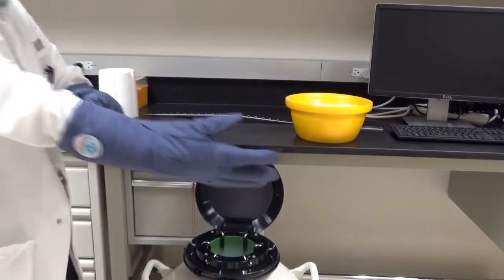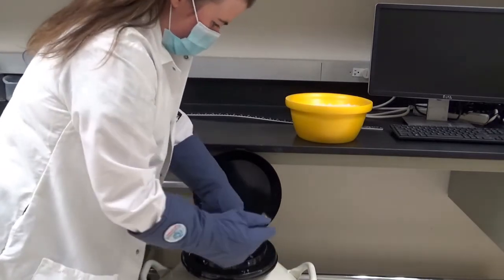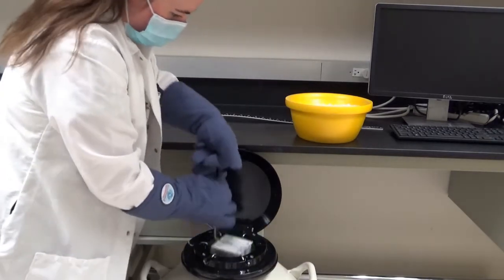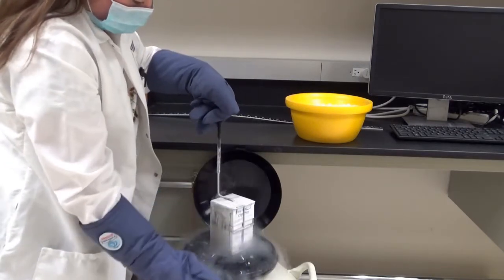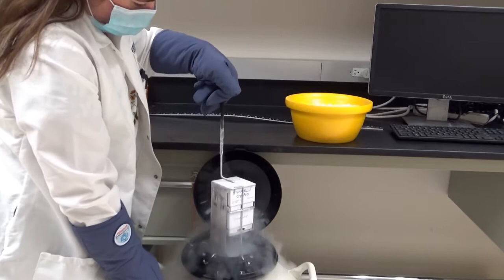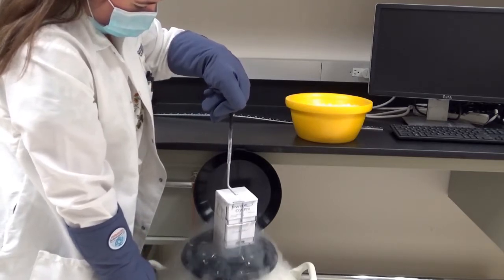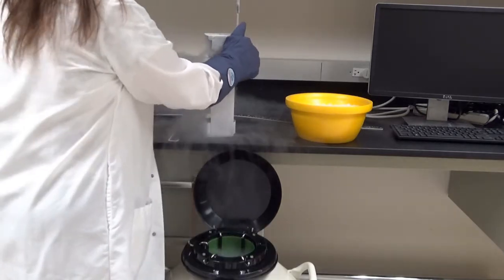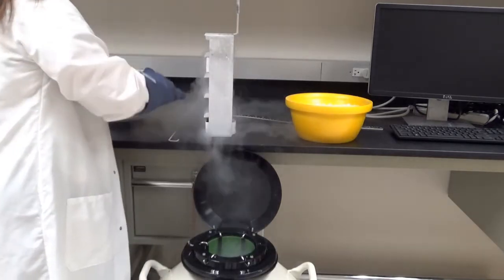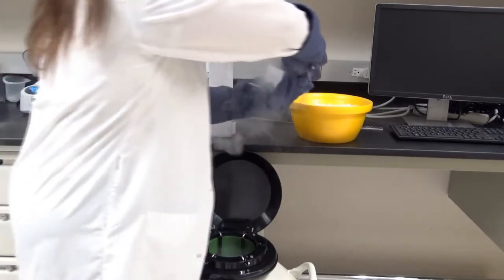Slowly pull the rack from the liquid nitrogen. The tank is kept quite full, and pulling the rack out quickly will cause the liquid nitrogen to splash and spill from the boxes. Pulling the rack out slowly allows for excess liquid nitrogen to drain back into the tank. The cryotube should be put on ice immediately to prevent melting, which will impact viability.